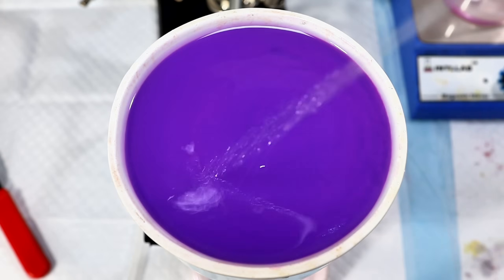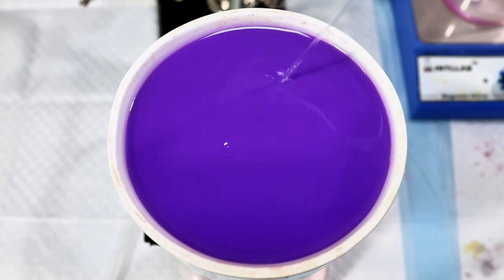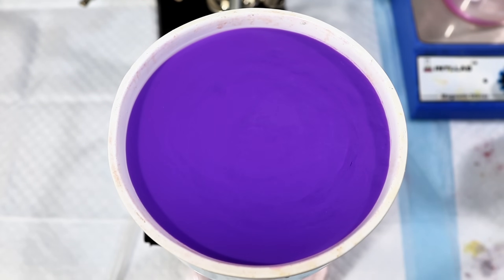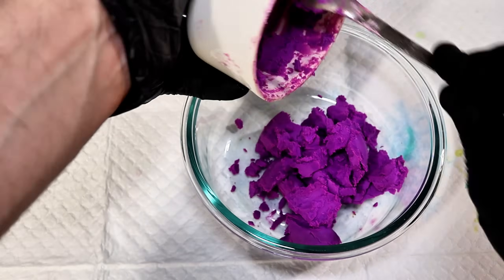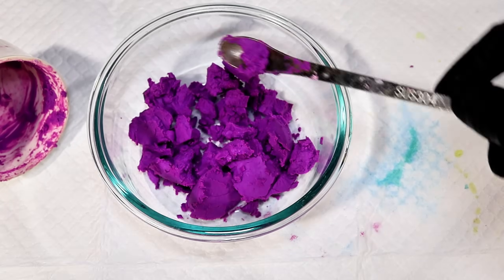I next went ahead and rinsed the cake of cobalt phosphate thoroughly with some distilled water, which again caused the color to blueshift. I pulled a vacuum on this for a few more minutes to remove as much water as I could, and then transferred it to a dish to dry.